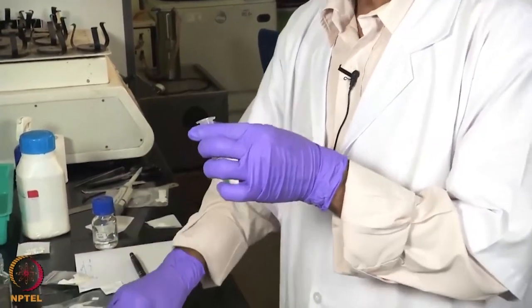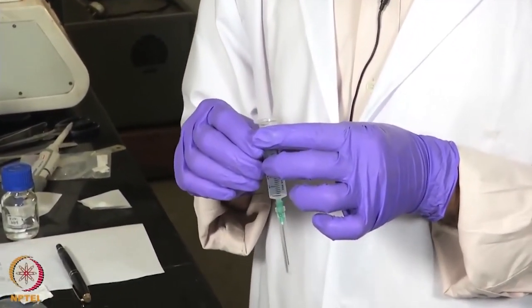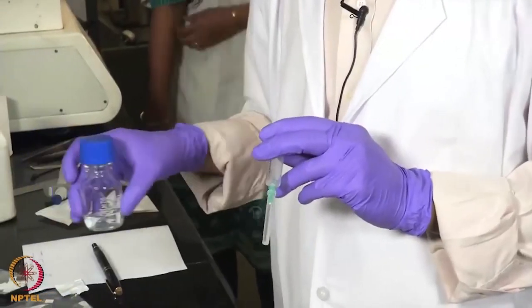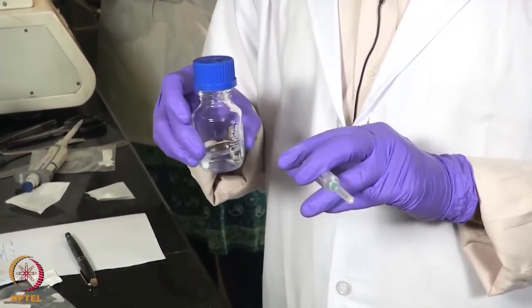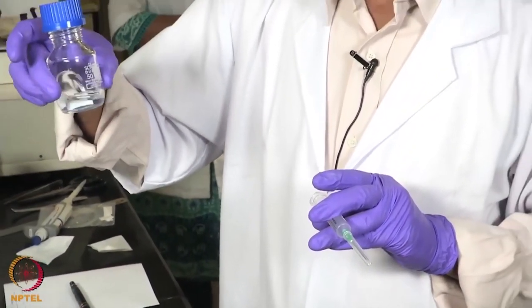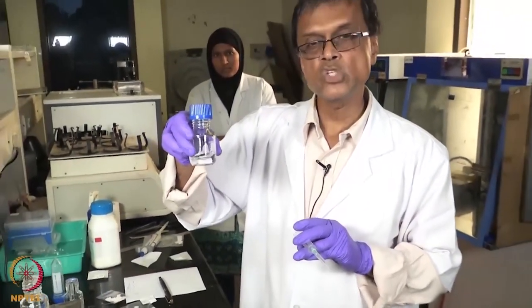Here again we are planning to make electrospun fibres of polyvinyl alcohol, that is PVA. We take 5 grams of polyvinyl alcohol of about 140 kilo Dalton molecular weight in 100 ml of water. If you heat it slightly for about 10 to 15 minutes it completely dissolves, and then I am going to take this polymer solution into this syringe.